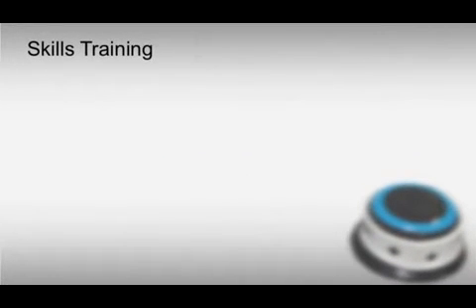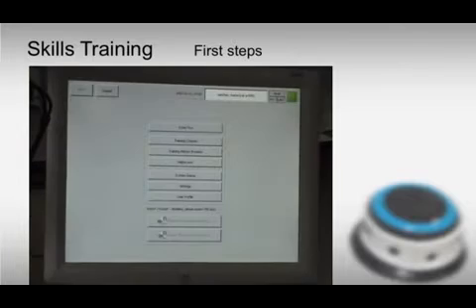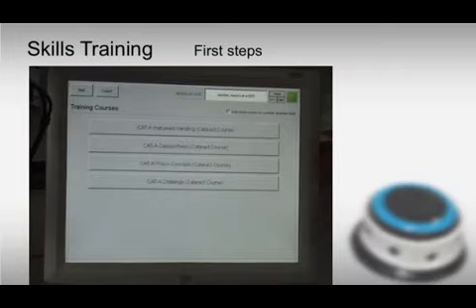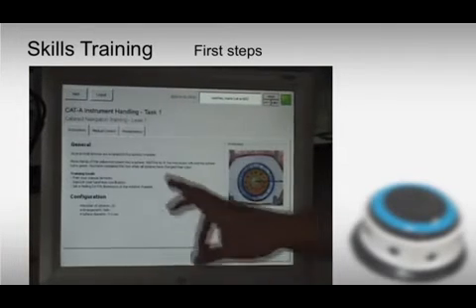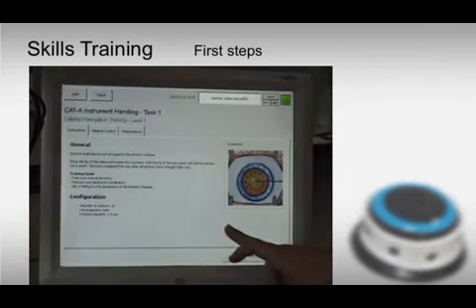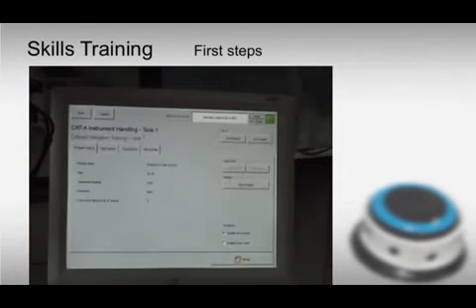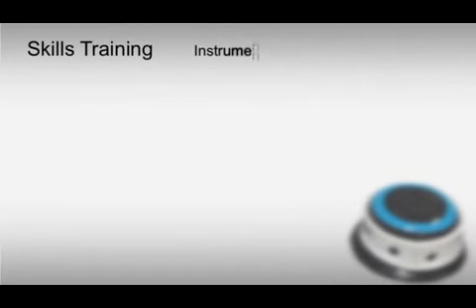To start the program, every user must work with their own ID and password. The software starts with an overview of the device's functions. The different training levels provide individual explanations advising how to perform the task. A second person can follow the training using the live image mode.